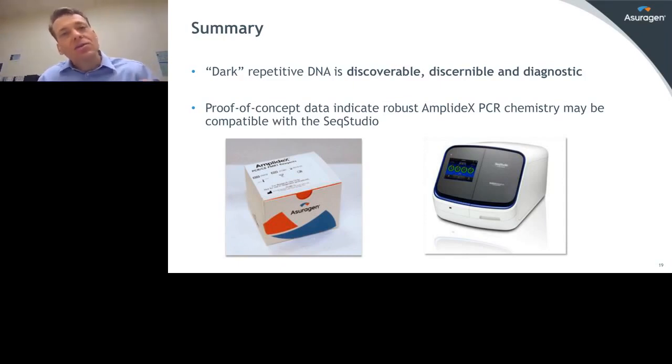And so that answers the three problems that I posed at the beginning. We do have reliable PCR chemistries that can amplify these really challenging stretches of the genome. We do have small-footprint, readily accessible and user-friendly instrumentation that can resolve these PCR products. And we do have workflows that can put these together to generate real insight on the back end. So I'll stop there and open the floor for questions.